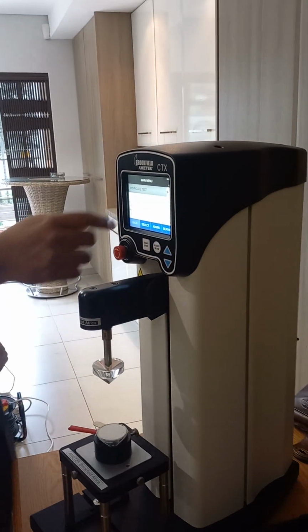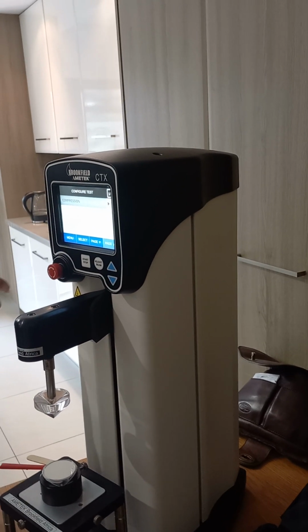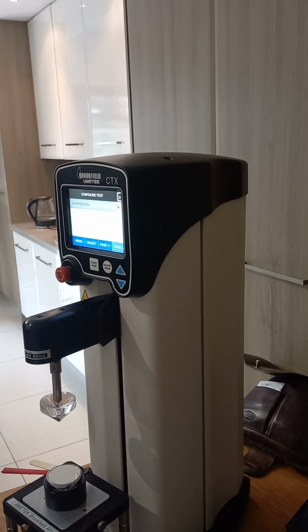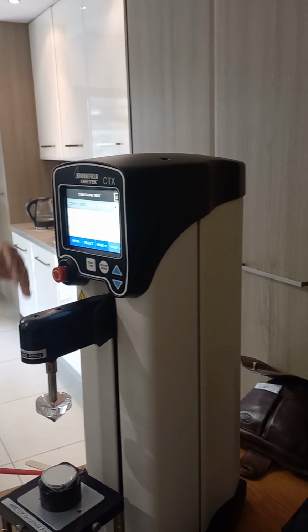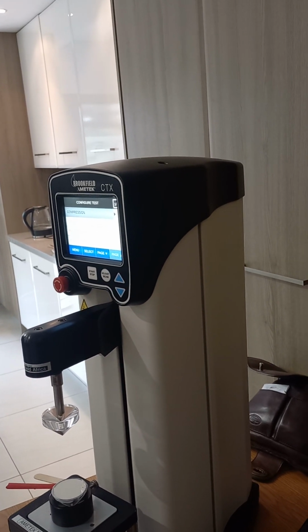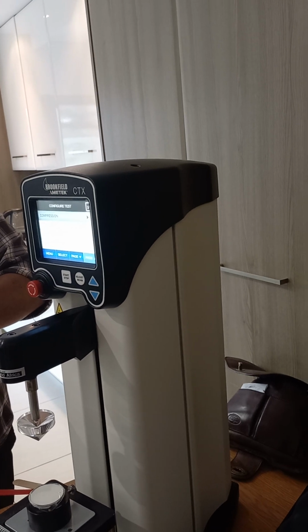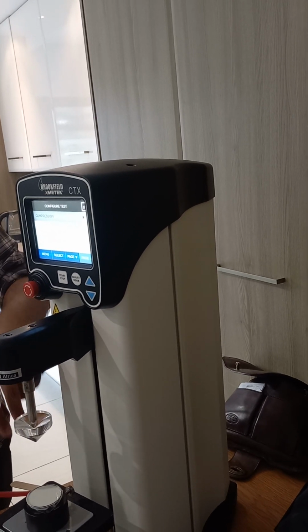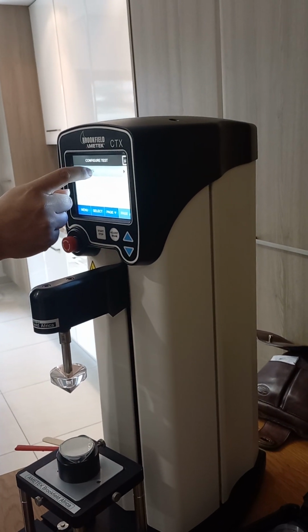Okay, so it's very easy to configure the test. Just click on that. The first thing it asks you is whether you want a compression test, a tension test, or you want to maintain at a specific load, or you want to stop at a load. So for spreadability, we're looking to compress the sample. This probe is going to go into that sample and compress it. So we're going to select a compression test.